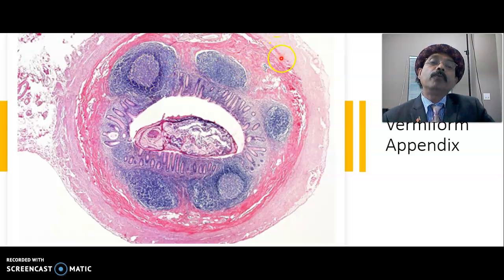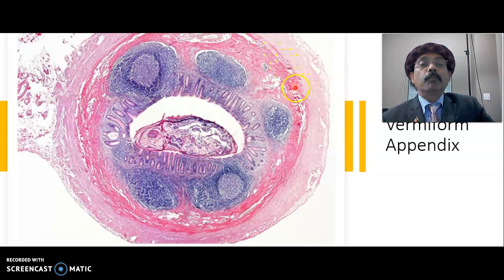Then we have the submucosa. Submucosa is composed of dense, irregular connective tissue. Like other connective tissue, both the lamina propria and the submucosa are vascular. Also in the submucosa, we get the submucosal nerve plexus, mostly parasympathetic nerve fibers, that forms the intramural autonomic nerve plexus. Okay, so we got that.